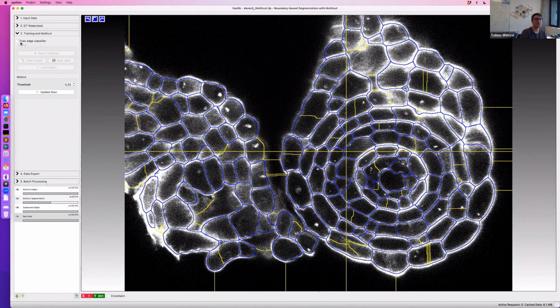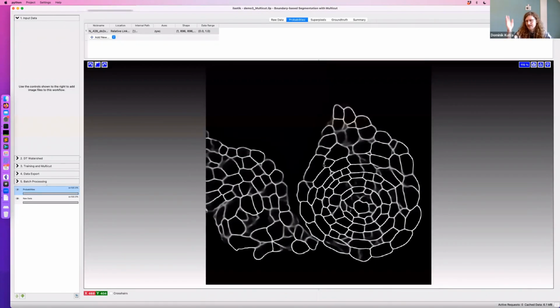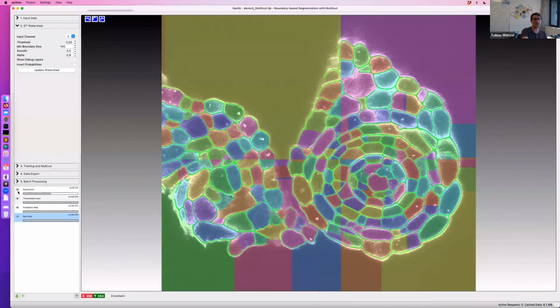Just to clarify, you have to hand mark these boundaries, right? So here you went through and you told the algorithm that the yellow ones are not true. No, here actually I didn't do that yet, because I was very confident in my boundaries, and it would only look at the boundaries that I've supplied in the beginning. It would look along these edges and see how good the evidence actually is. Also, the automatic update that you ran already did this classification in yellow and blue automatically.